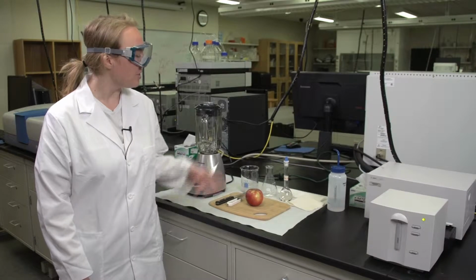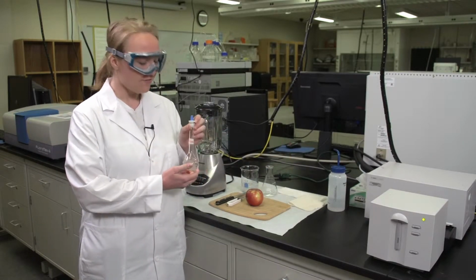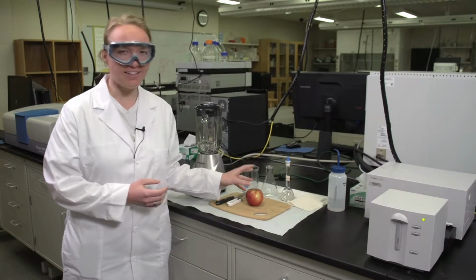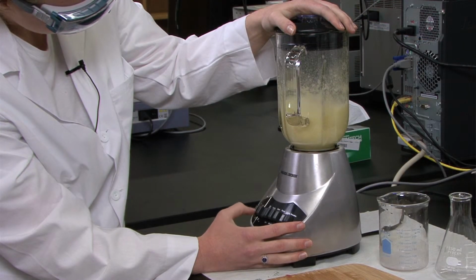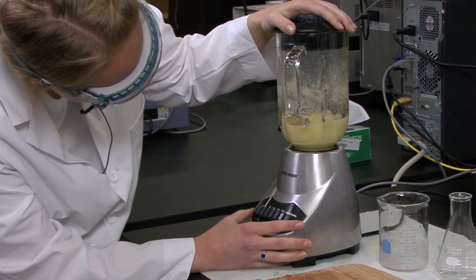Next you'll need to prepare your catechol solution, which is the substrate for this reaction, and follow the instructions in your lab manual to do that. And then you'll need to prepare the apple enzyme solution. So peel the apple and then cut it up and put it in the blender with 200 mL of ice water, and then blend that until it is smooth.